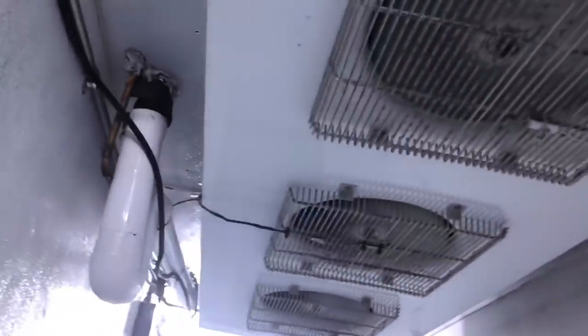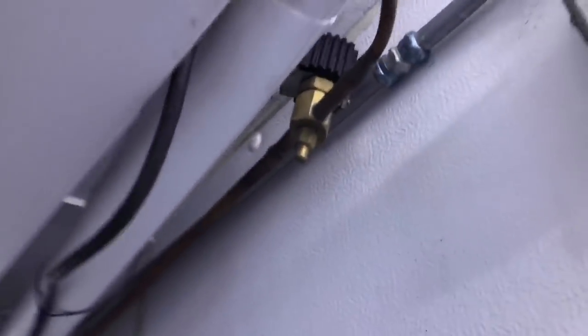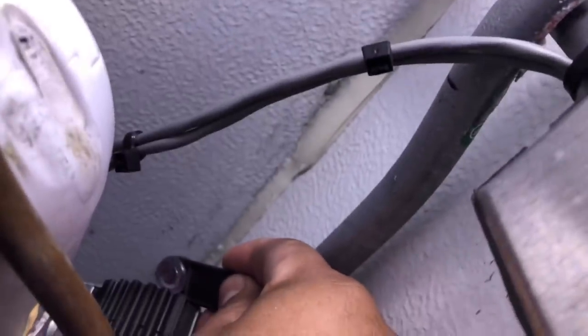All fans are running. The evaporator coil is clear, no ice. It's calling — so let's go check the condenser.